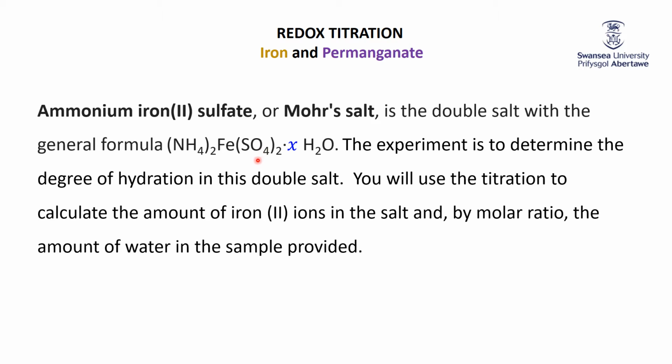You also have, as is common for quite a lot of ionic compounds in the solid state, some waters of hydration, waters of crystallization, whatever you want to call it. And the idea of this is to determine the value of X.